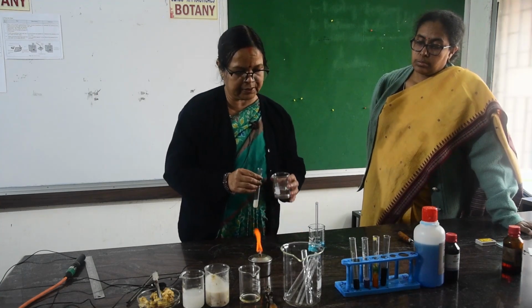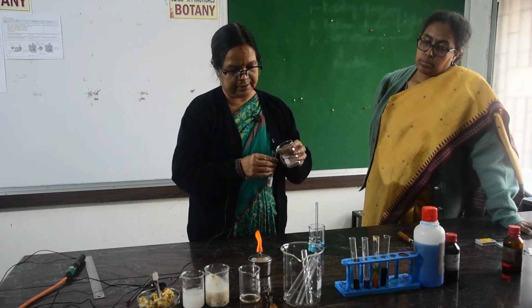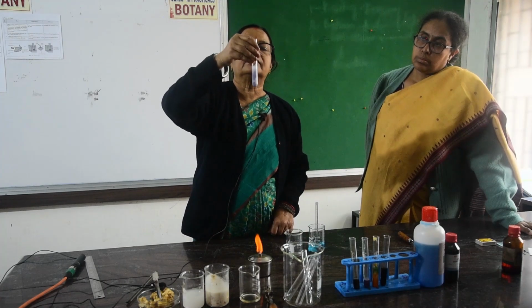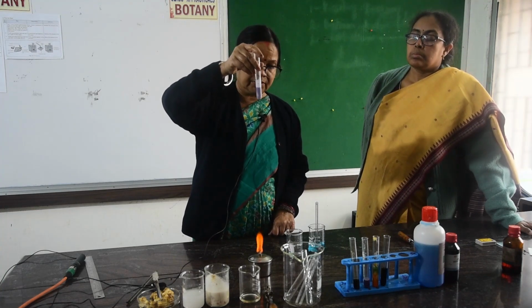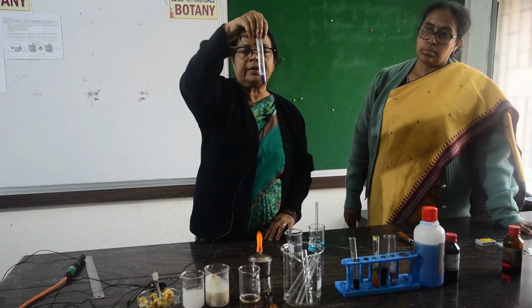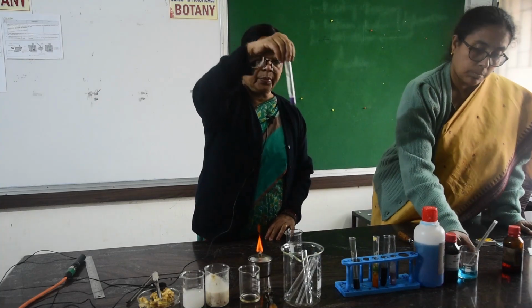This is dilute sodium hydroxide. Look here, the color gradually turns to purple, which indicates the presence of protein. It will gradually convert to dark purple, and after some time it will convert to this type of purple color, which indicates the presence of protein.